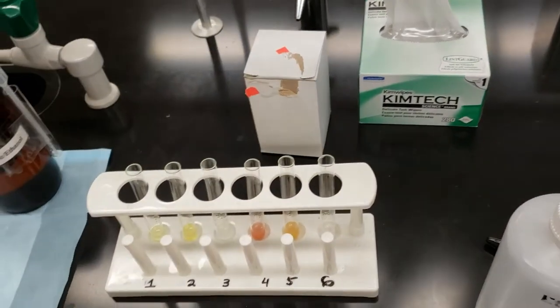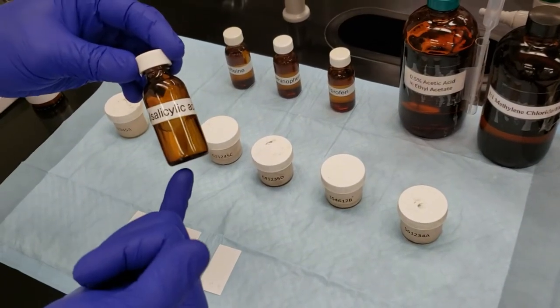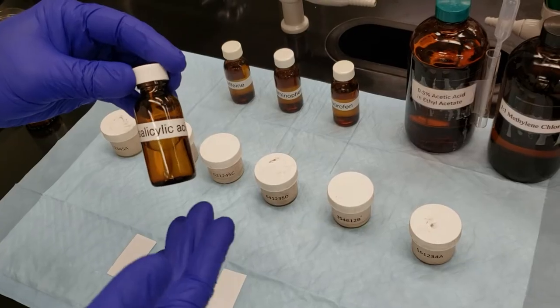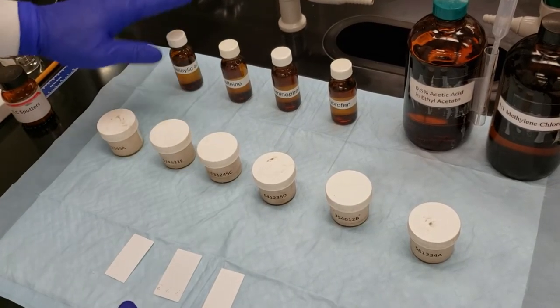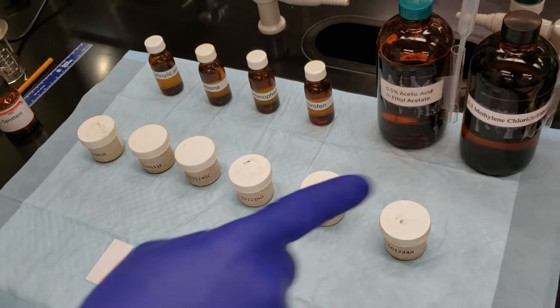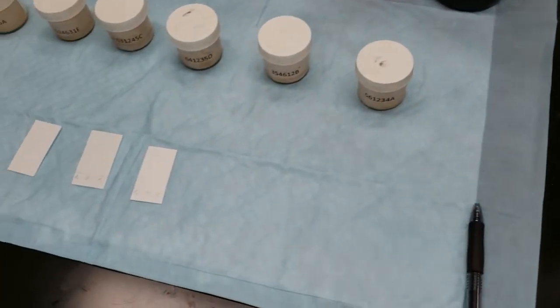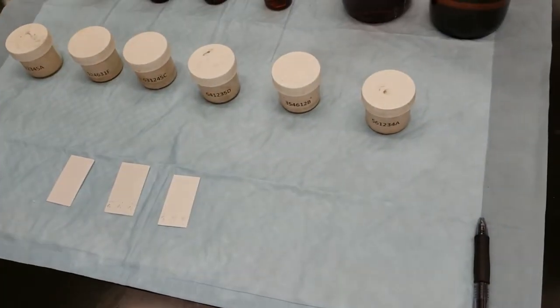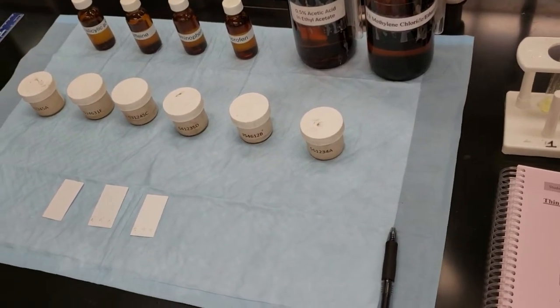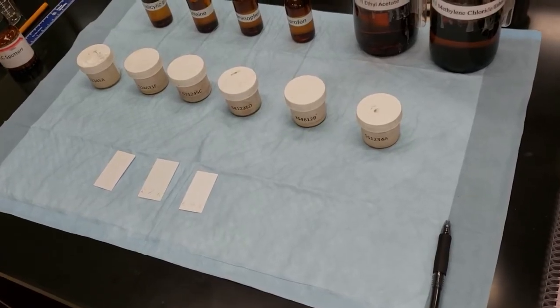Now we have the same solvent system here that we've already dissolved our known components in. So this is acetylsalicylic acid or aspirin. So we're going to use these four knowns. These are the active ingredients for all of our unknown mixtures here. We're going to spot those on our first plate, and then we're going to spot our unknown solutions onto two additional plates and compare and contrast the Rf values. You've talked about Rf values with your TA already in the pre-lab lecture.